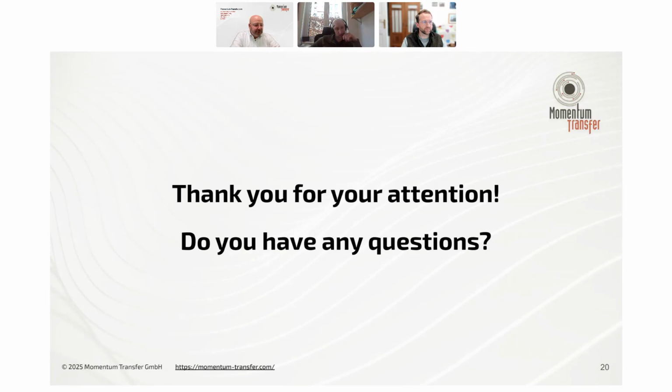In future versions of the tool, do you anticipate adding the option to do refinement after search match? Possibly. It could be that we make another tool you can connect the results from this to. But let's say in terms of our platform, yes, we are thinking quite a lot about how to get you guys to quantitative results faster. So yes.